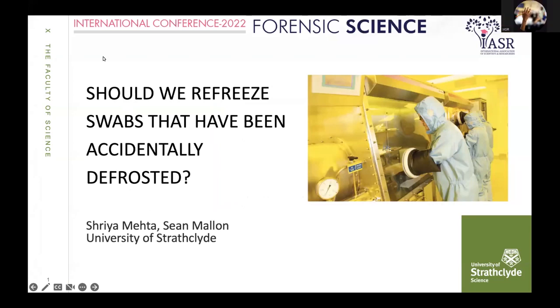Good afternoon, everyone. I am Shriya Mehta, a master's student from University of Strathclyde, and I'm here to present my research on accidental defrosting and to discuss the issue of whether we should refreeze swabs that have been accidentally defrosted.